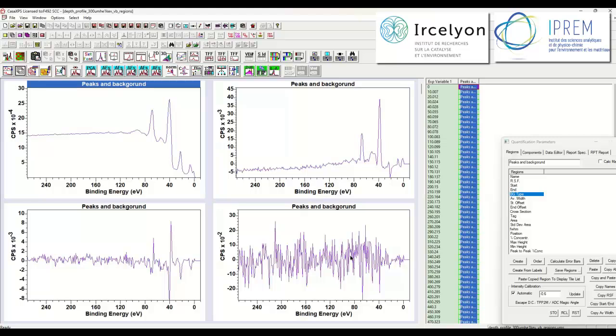This one looks very much like noise, and I've got 2 that are much more dominant than the third. So I have some hope that I can work out from these data 2 spectra that will represent most of the variation in this data set as a whole.